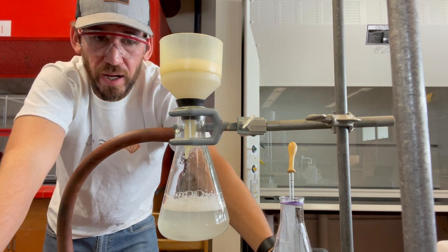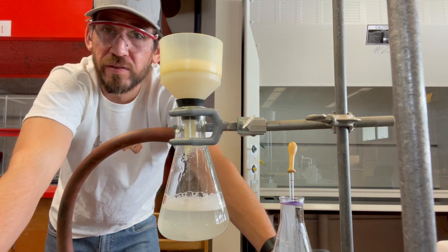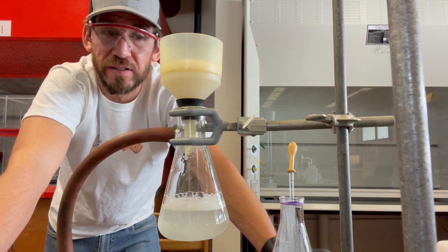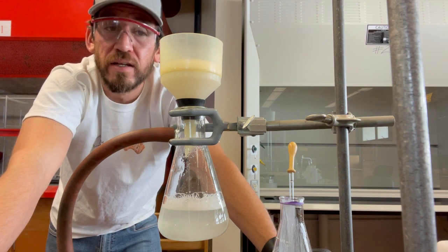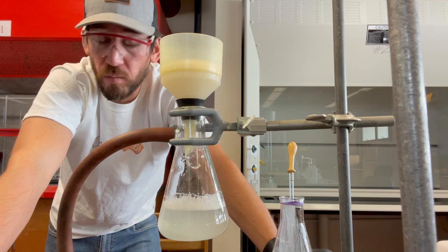And so that's the purpose of decanting the liquid slowly at first, so that you can minimize the clogging of that filter. Because otherwise it would take forever, and you don't want to wait forever.